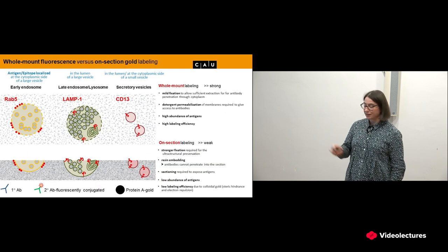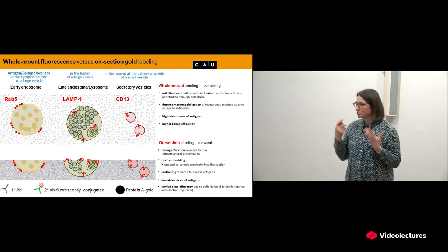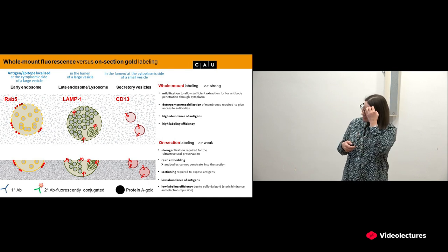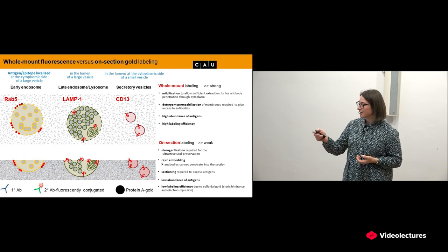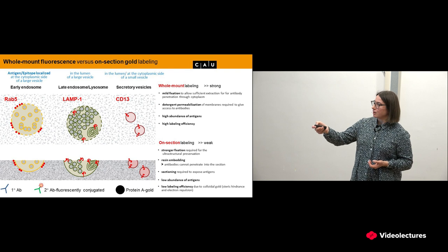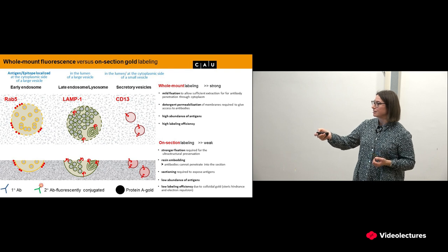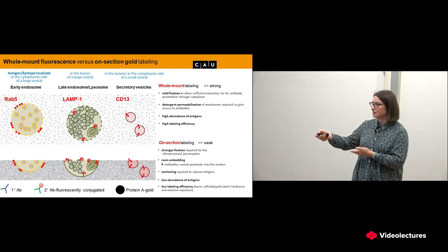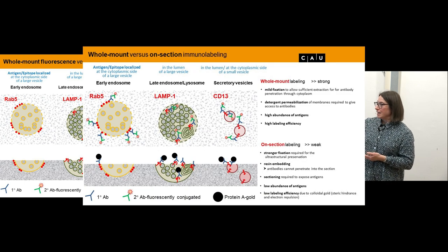It is more complex. Here, just to recapitulate the specifics and the limitations presented on the on-section labeling. Different kinds of epitopes. Here you see you have them on the outside of the endosome, here also in the lumen and intraluminal side, here they're just in the vesicles. So the point is this is much more strongly fixed, so the antibodies cannot penetrate in this tissue. They could also be plastic. And when the labeling is done on sections, here we have them also penetrating inside.